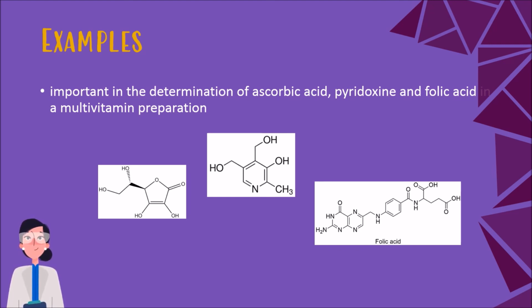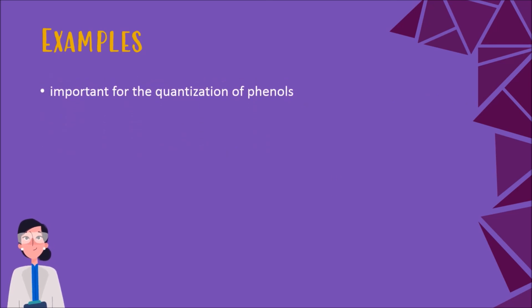Lastly, it is also important for the quantization of phenols.